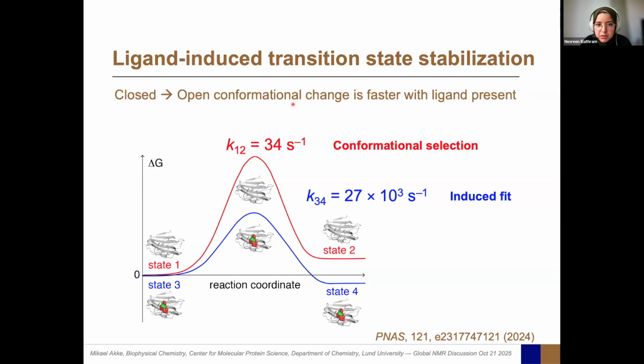We only have nitrogen in this case. Well, you saw there's a handful of residues that get significant chemical shift difference between free and bound, and hence significant dispersions. So it's quite likely that if you were to measure with other side chain probes, you would see more data, have more probes of the process.